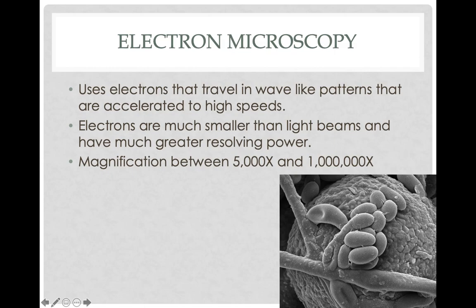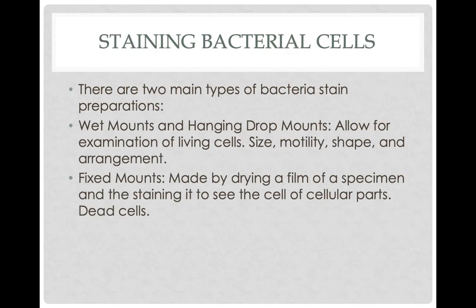So the bacteria cells right here. You would never see bacteria this close, this detailed, to be actually seeing the bumps of their surfaces, the little grooves and things that they have on them, with the types of microscopes that you'll find in most schools, compound microscopes and things like that. So electron microscopes are really good at taking really detailed pictures.